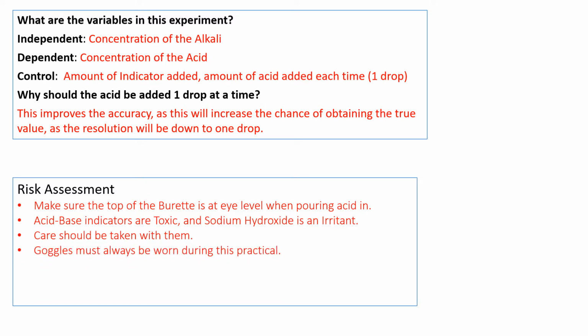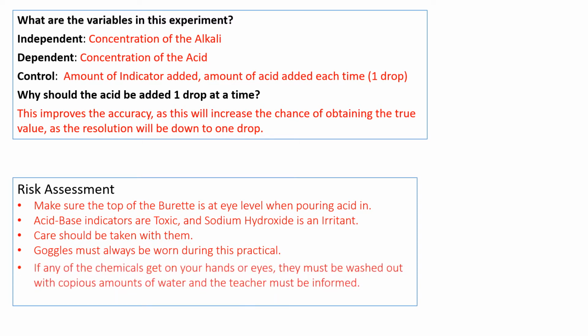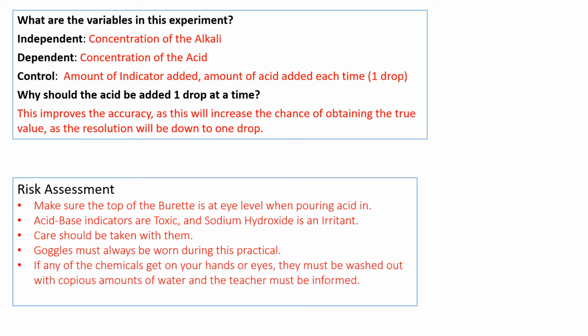Goggles must be worn during this practical, and if any chemicals get spilt on your hands or in your eyes, they must be washed out with copious amounts of water, and the teacher must be informed immediately. If they're ingested, I'd question what you're up to, but medical treatment must be sought immediately. Okay? There have been people that have been that daft.